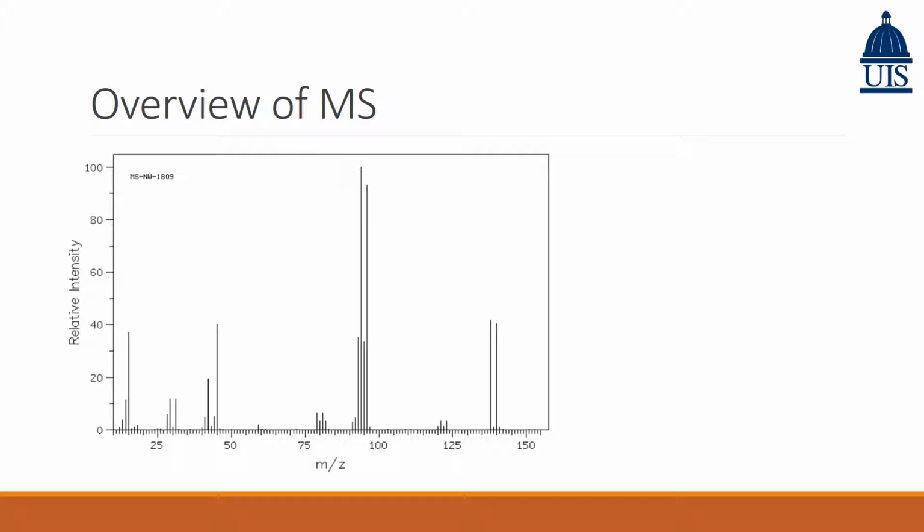What mass spectroscopy basically does is take the molecule and destroy it into a million different fragments. And these fragments, based on their stabilities, are going to be present in different amounts after the procedure is done. So you got peaks here, you got peaks here, you got stuff going on here, you got all sorts of lines. Now what we're going to be able to do is take these different lines along with our knowledge of IR and come up with some possible formula and structure for our molecule.